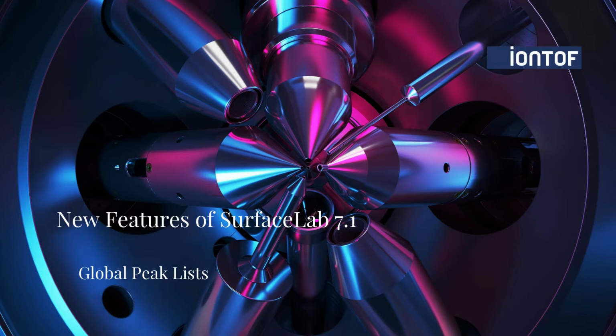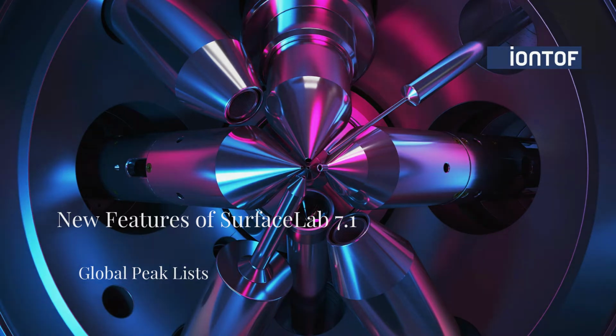My name is Matthias. Today, I would like to briefly introduce you to the global peak list feature. Global peak lists are an important prerequisite for the multivariate statistical analysis features recently implemented in SurfaceLab 7. However, I'm sure that they will also have quite handy applications in your daily data analysis work.